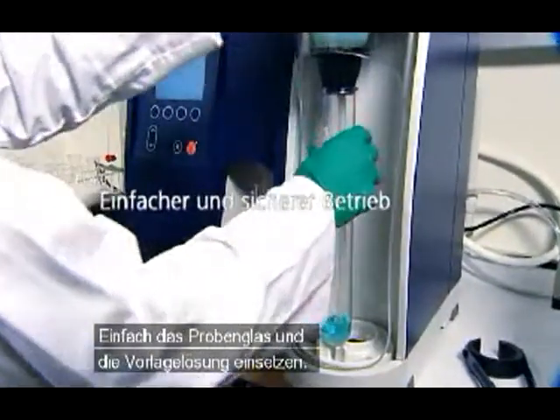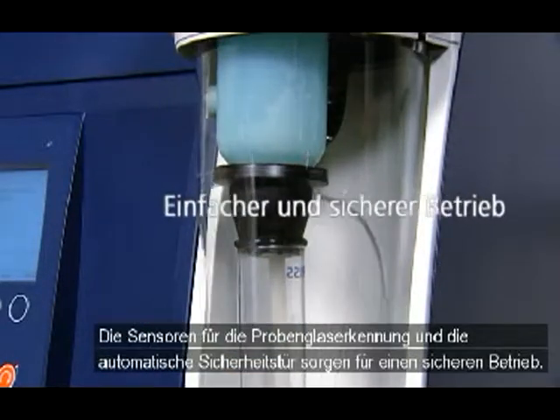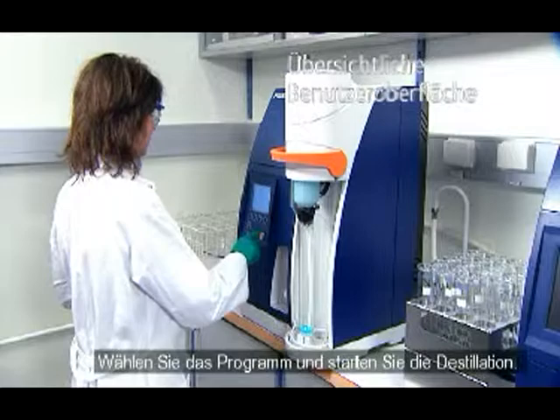Just float your sample tube and put the receiver solution flask in place. Sensors for tube-in-place confirmation and the automatic safety door ensure safe operation. Select the program and start the distillation.